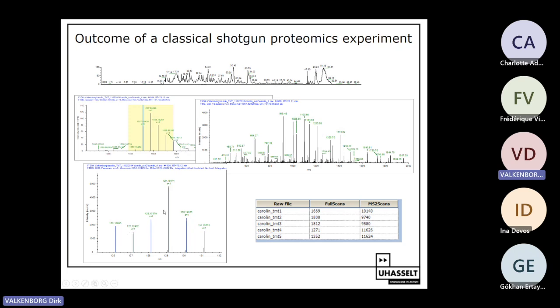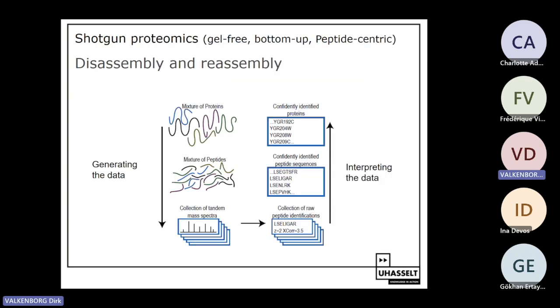You can see, for example, in sample 129, which is labeled by the label 129, that the peptide is way more abundant in that sample than it is in the other ones. So, different types of data, complicated structure. How are we going to analyze this? Well, we are going to do this using computers.